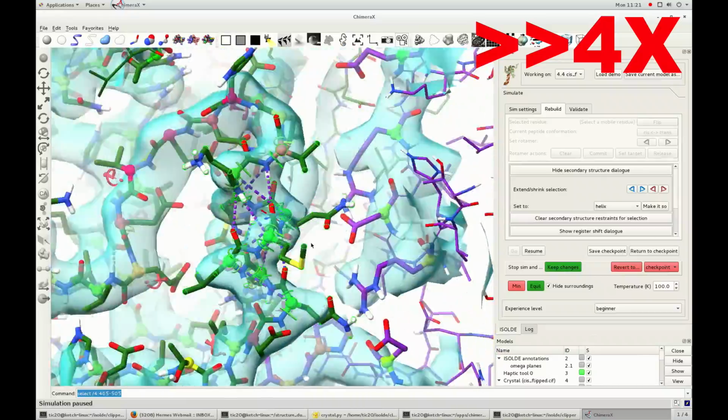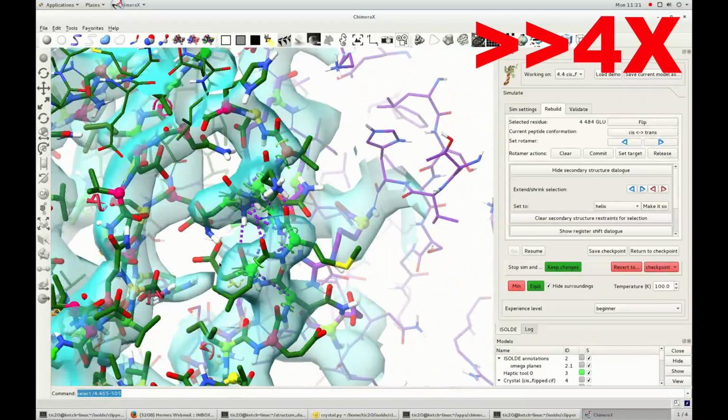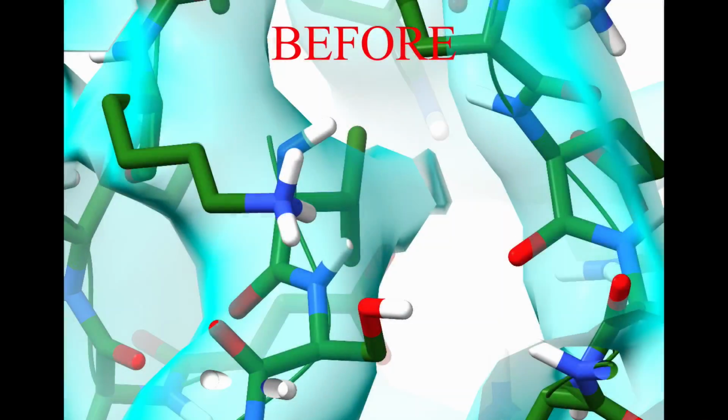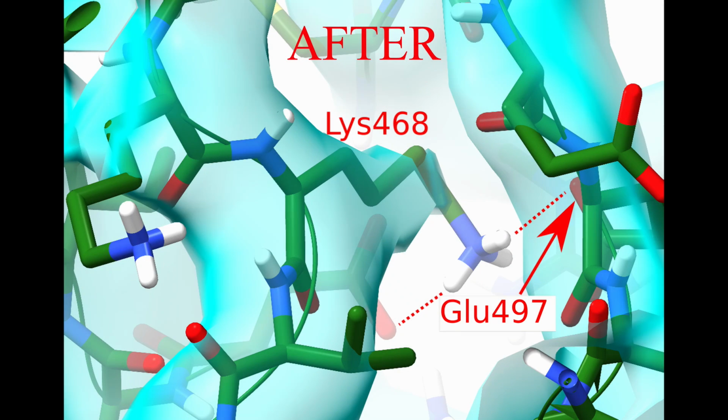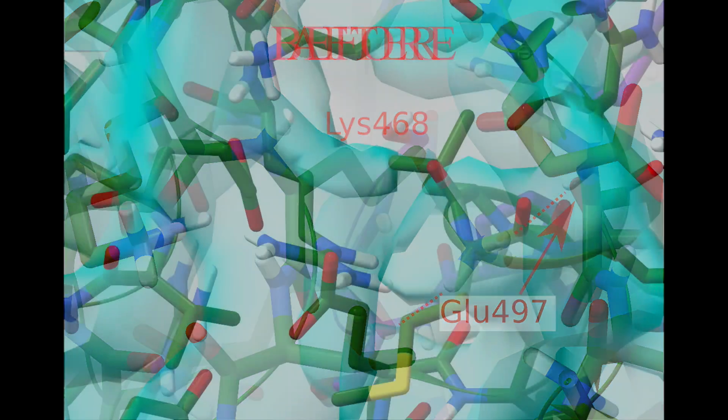Jumping forward a bit, let's take a look at a few before and after stills of this region. Where valine 469 was previously, we now have lysine 468, nicely filling the density and forming a neat double salt bridge with aspartic acid 431 and glutamic acid 497.